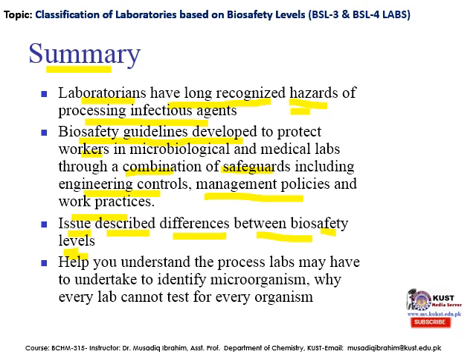Now, this lecture will help you understand the process labs may have to undertake to identify microorganisms. There are certain steps through which the lab personnel have to go to identify the microorganism, and every lab cannot test for every organism, because the labs may not have the facilities, infrastructure, and equipment needed for testing or identifying that microorganism, and for that purpose you need to go to another biosafety level lab for the identification of that microorganism.